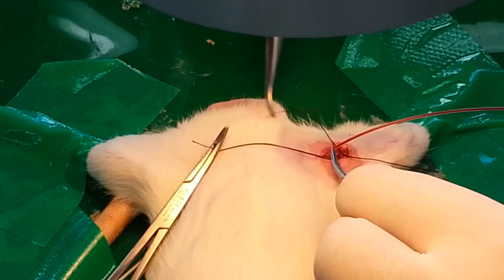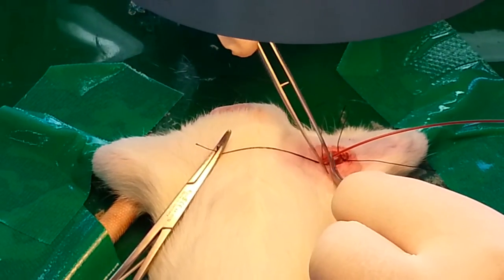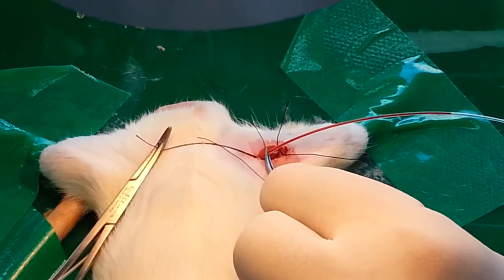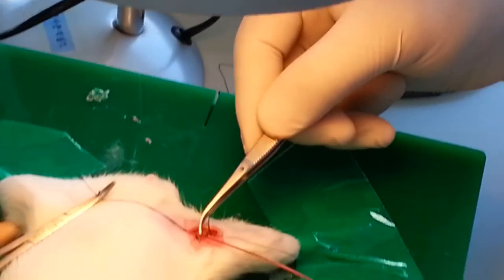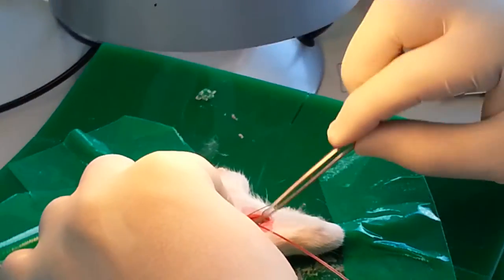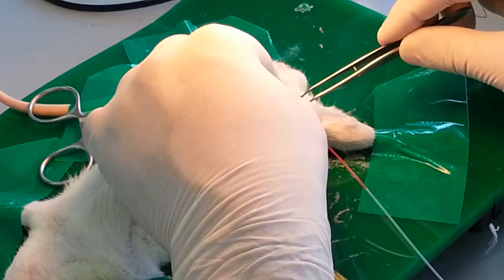We will put another thread over here so that our tube may be held in a good position.